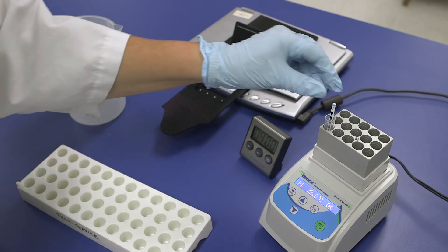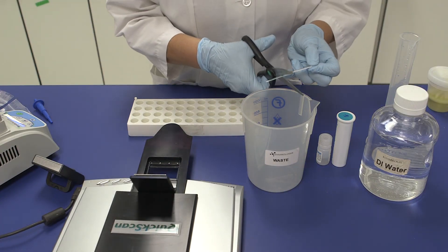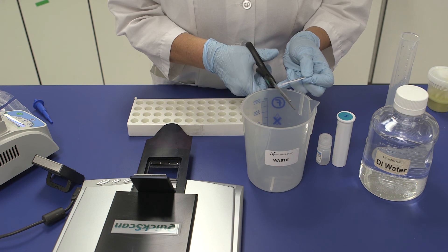Step 5. At exactly 4 minutes, remove the test strip from the tube, cut off the tail pad and immediately place the strip in the quick scan reader.